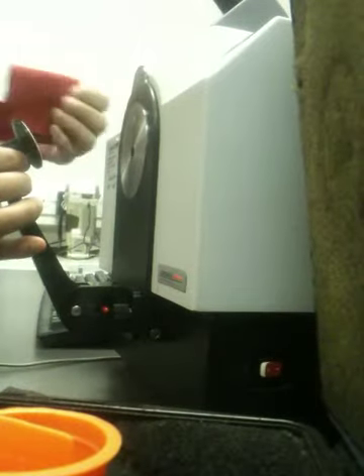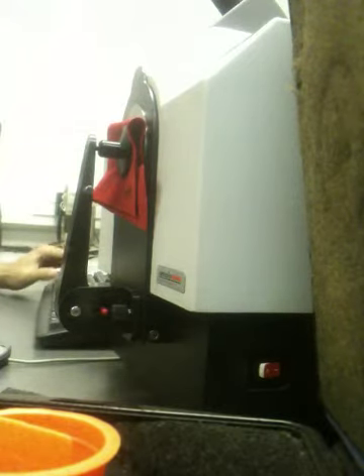So this is your batch, right? The standard is there. Say for example, I'm just putting in something else. It takes just one measurement, right?